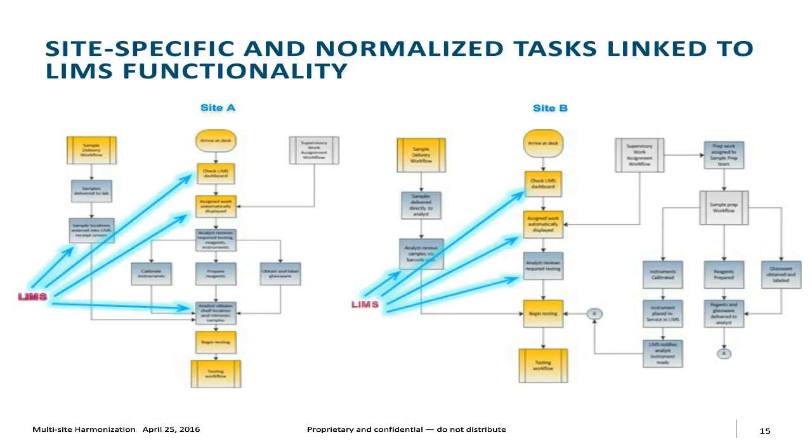We look at process improvement. The second arrow on the left side points toward a LIMS dashboard. That is the backlog report for a laboratory person, so they can understand what work is to be done for a day. The assigned work is automatically displayed now. We're presuming in this case that a supervisor in advance has done assignment of work, or that certain work is assigned to a particular laboratory entity. So now it's displayed automatically. We don't have to hunt up that work. We don't have to try to figure out what we're going to do in a particular day. The last arrow on the left side shows that the analyst obtains the shelf locations and retrieves the samples, and those kinds of things.